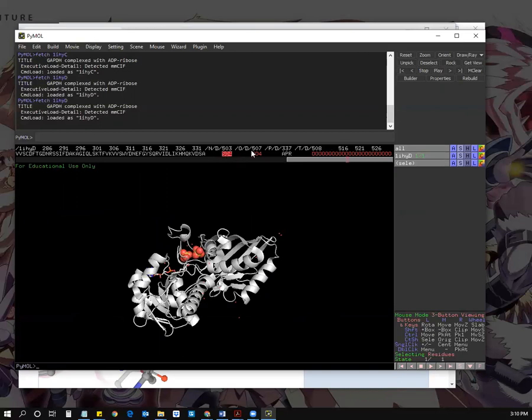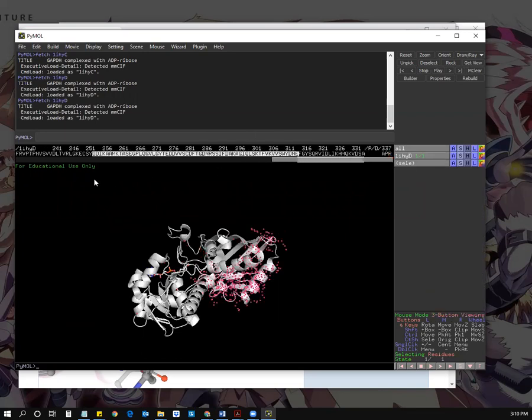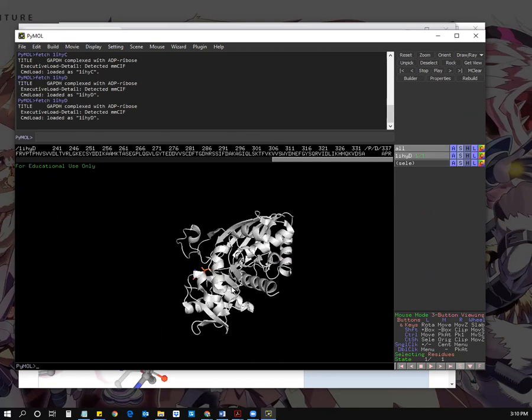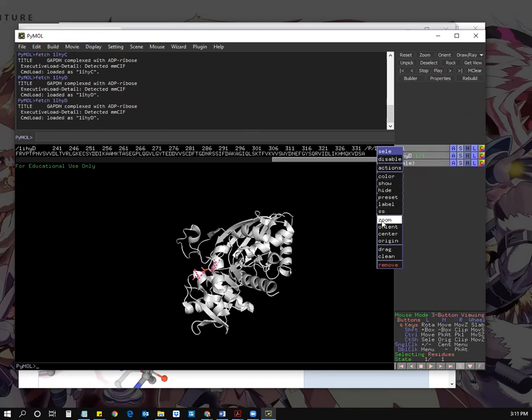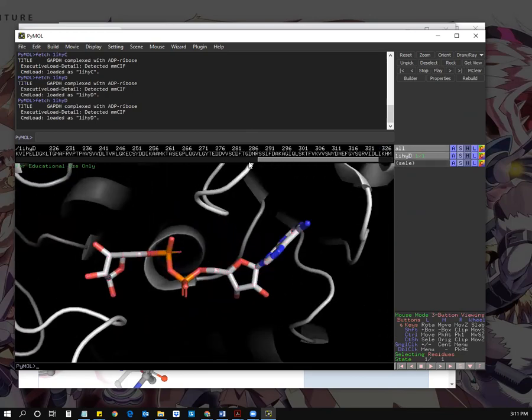I'm just going to really quickly take those sulfates and that water, and remove those atoms so that I'm only left with the sequence and also the ligand code of my protein. I am going to then click on the ligand code up in the sequence scroll bar and right click that and select zoom. And now what I'm looking for in the sequence is aspartic acid 31. I think it was like 32 or something, but anyway, it's this one right here. So it's the letter D.